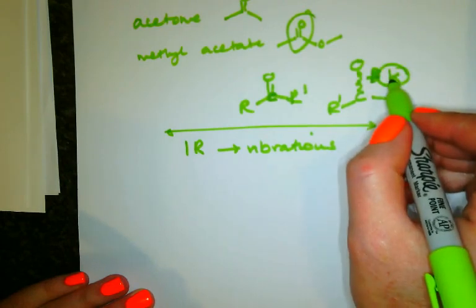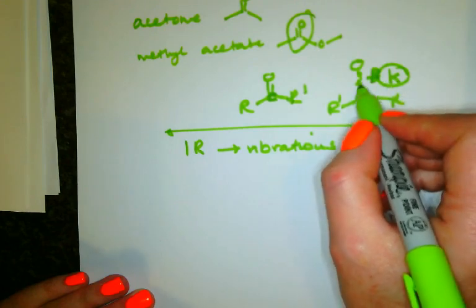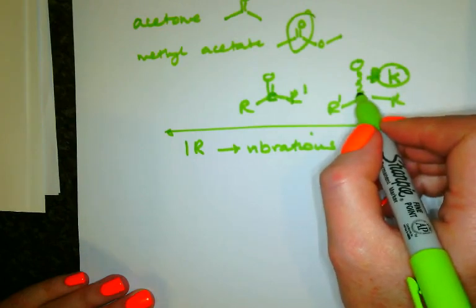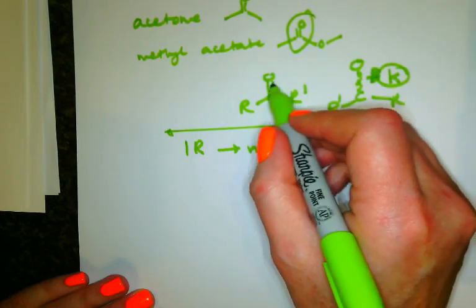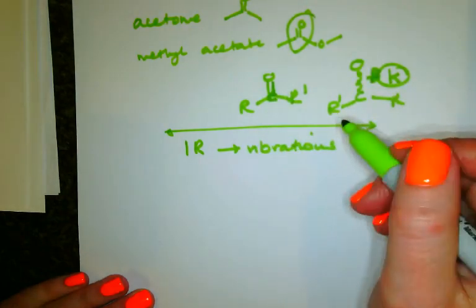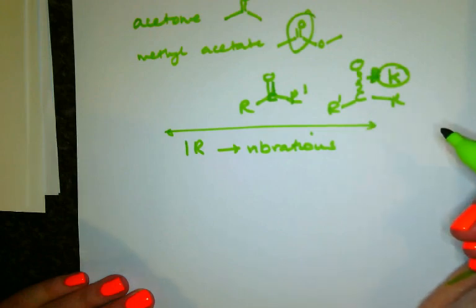And the higher the force constant, K, the stiffer the spring. So the larger K, the stiffer the spring. And this is what we want to calculate in this experiment, the stiffness of that bond when it vibrates. So how easily does it vibrate? The stiffer the spring, the more difficult it is for that bond to vibrate.